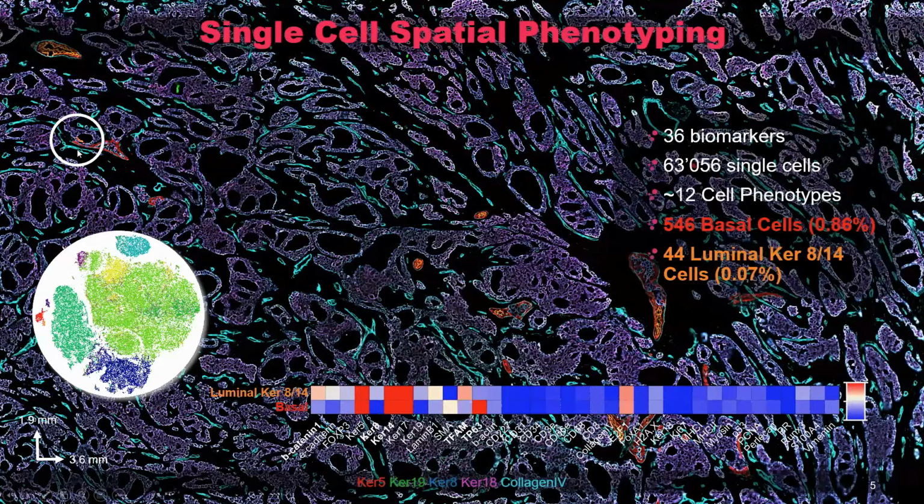Now you can see an example of these luminal cells right here. So this is an epithelium, a secretory epithelium, and nudged in here are these three little cells. There are a couple more over here, and here and there you see additional ones. How can we identify these? Well, evidently via clustering, the algorithm picks them out.